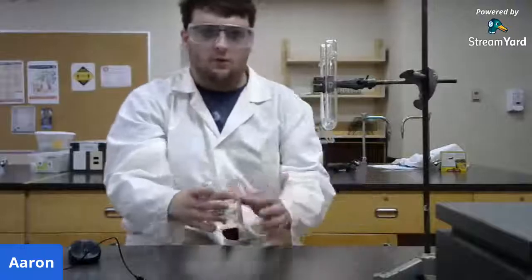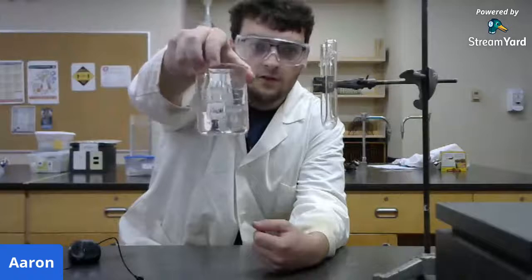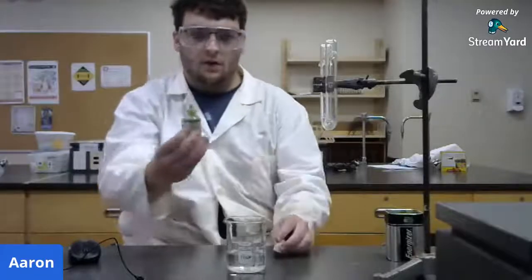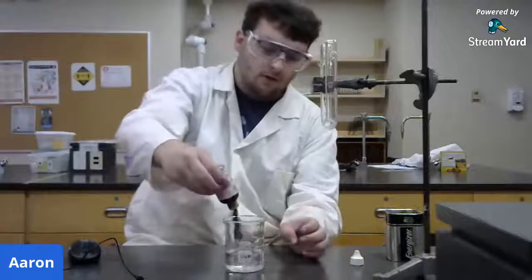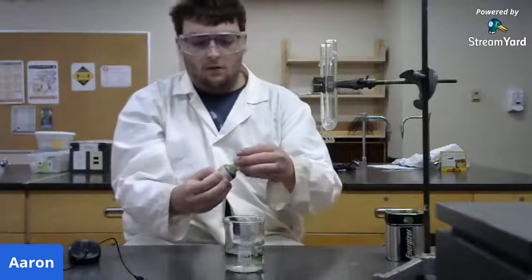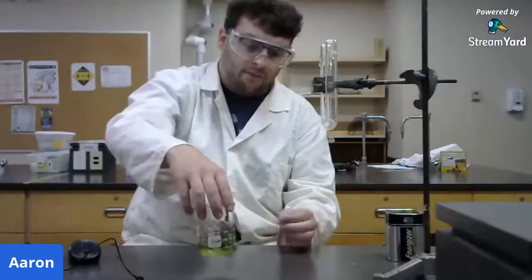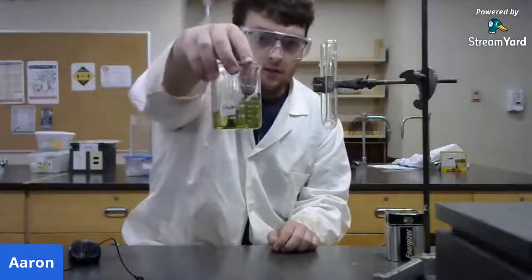So to the U-tube, I'm going to add a salt solution. This is just salt and water, plain salt and water. And I'm going to add some universal indicator, which you might recognize from some of our other videos. I'm going to be pretty generous with this. Give it a quick little mix. And as you can see, it's green.